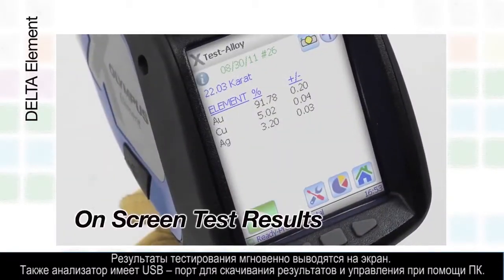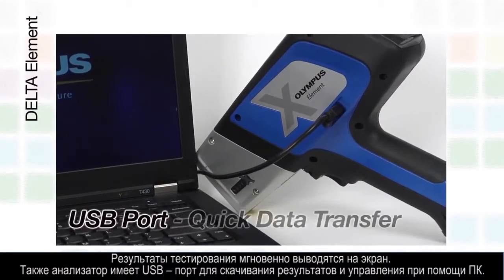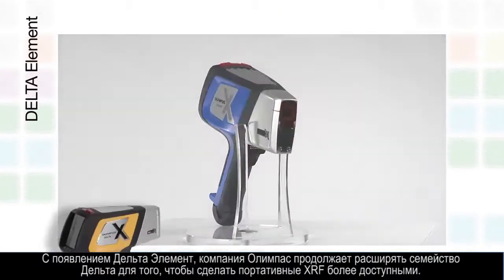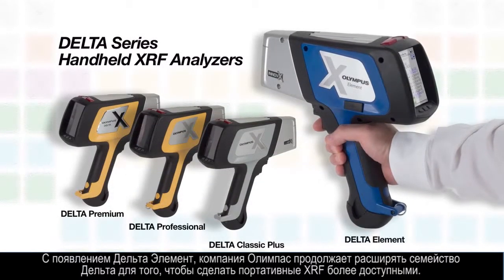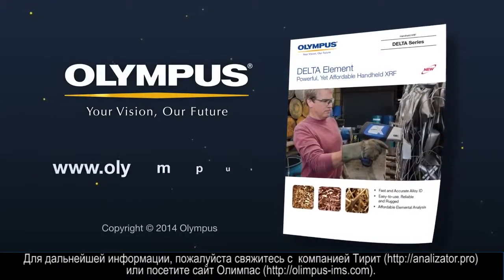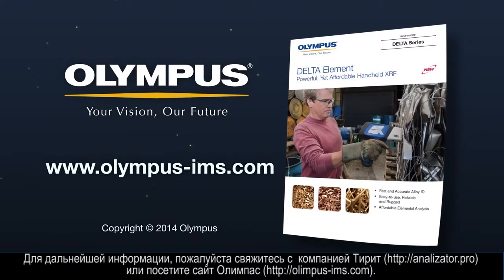Test results can be viewed on screen, and the analyzer has a USB port for downloading results and seamless PC control. With the introduction of the Element, Olympus continues to expand the Delta family to make handheld XRF more accessible and affordable. For more information, please contact your local representative or visit us online at www.olympus-ims.com.